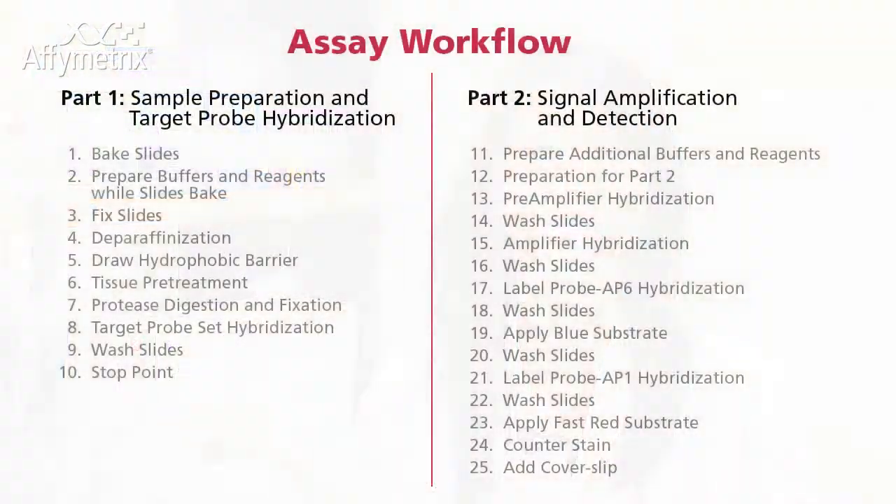If you mount your slides using the DACA Ultra Mount, then you can store them at 4 degrees Celsius for long term. However, if you use the Inovex Advantage, then you can store them at room temperature. The step in the assay workflow highlighted in this video is how to add the cover slip.